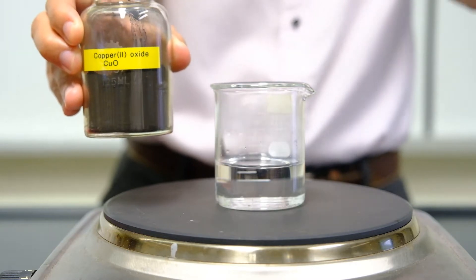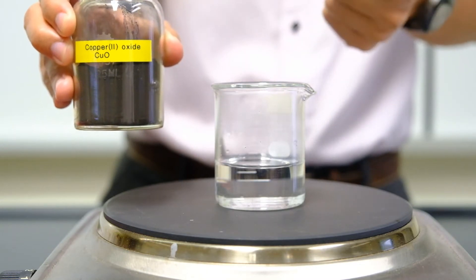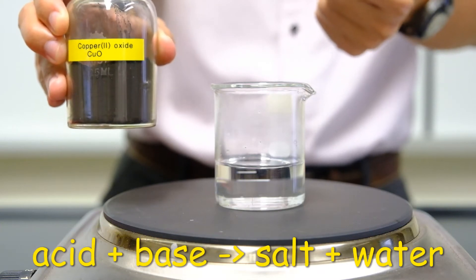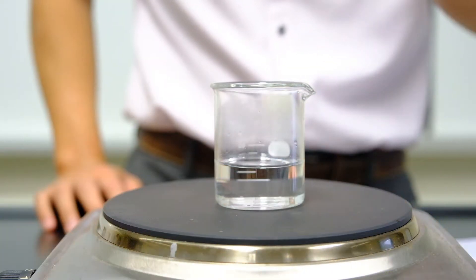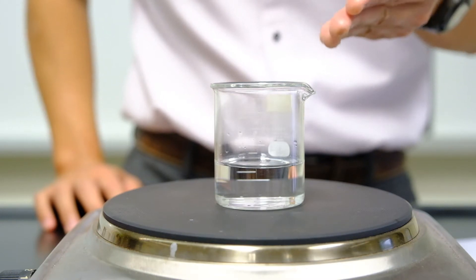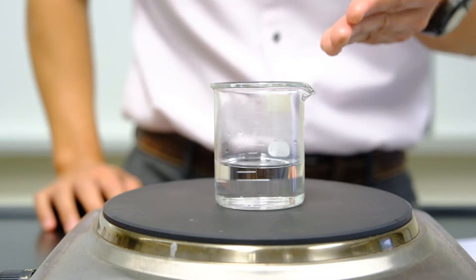I'll be adding copper-2-oxide into sulfuric acid. There will be a reaction because acid plus base forms salt and water. The sulfuric acid has been preheated by the hot plate. This helps to maintain the temperature of the acid as well as to speed up the reaction.